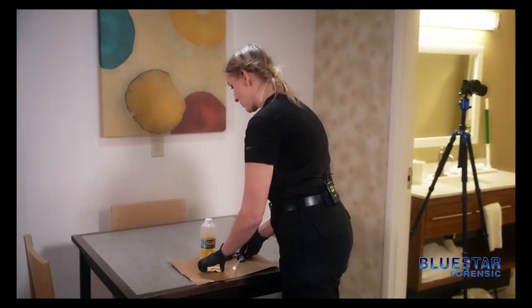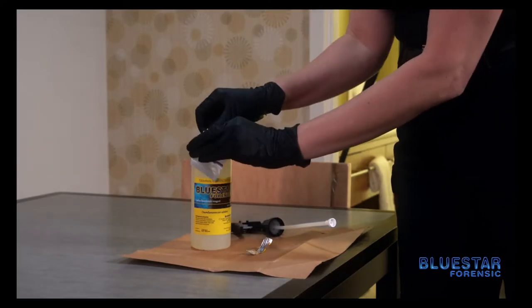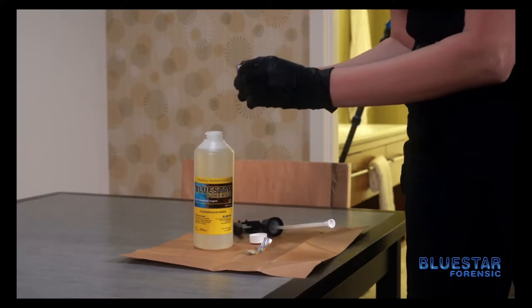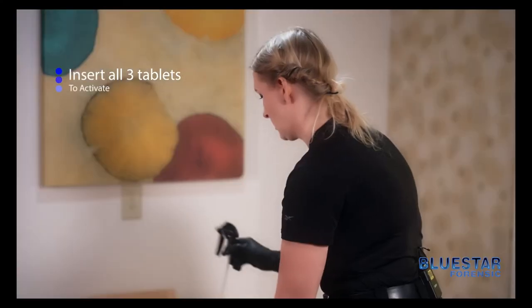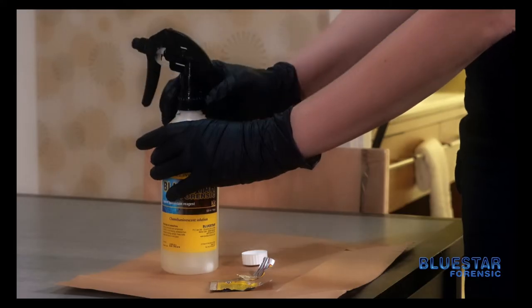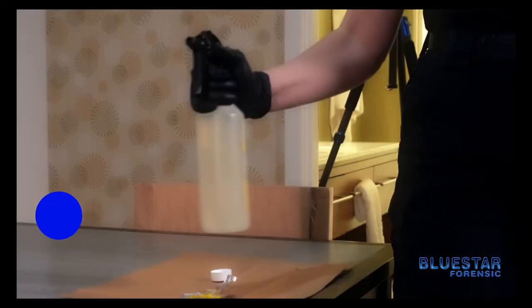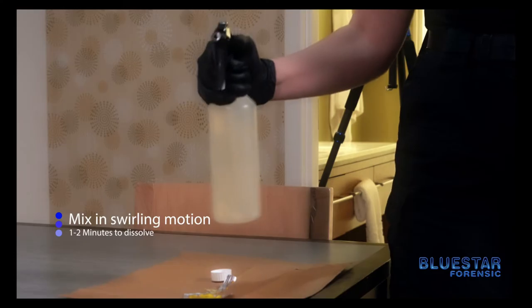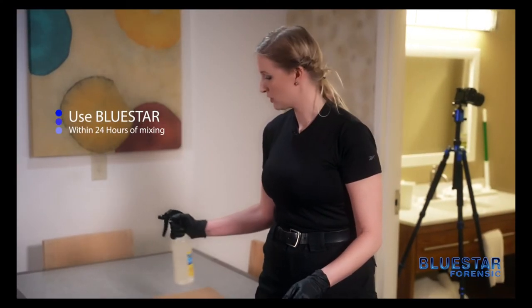The first thing that you want to do is open the foil package with the tablets. You are then going to drop all three tablets into the solution to activate it. You'll then close the bottle and you want to mix it in a swirling motion for approximately one to two minutes so that the tablets can dissolve and activate the solution. You also want to make sure that you use this product within 24 hours of mixing.